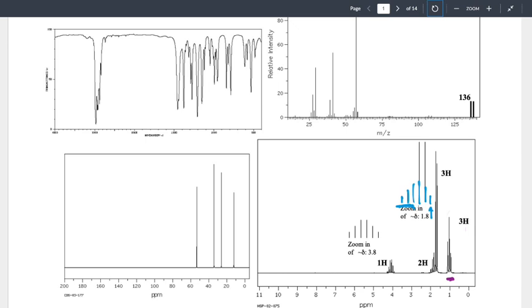Okay? If we summarized our interpretations here, down here, would we have a problem? How many carbons have we identified here? A lot more than 4, which, what does that mean? Gotta combine some of them. I've got to combine some. I've duplicated content. Right? So now what I can go through and do is look at those pieces and be like, well, where did I duplicate? Where did I duplicate? And in deciding that duplication process, I typically start with the ends, so CH3s.